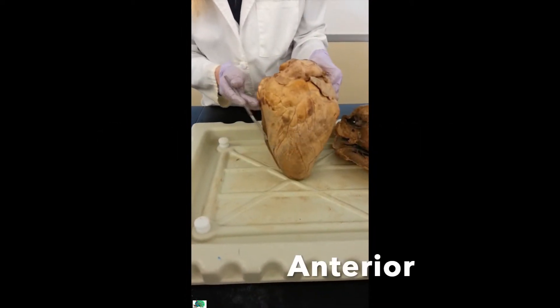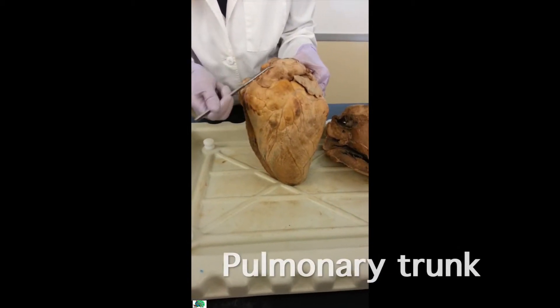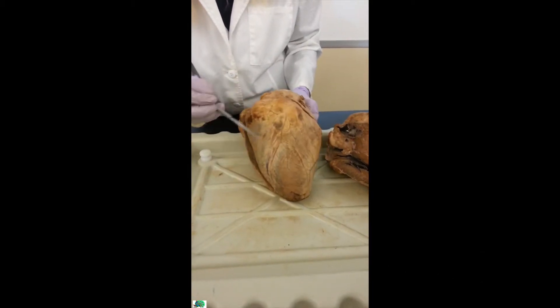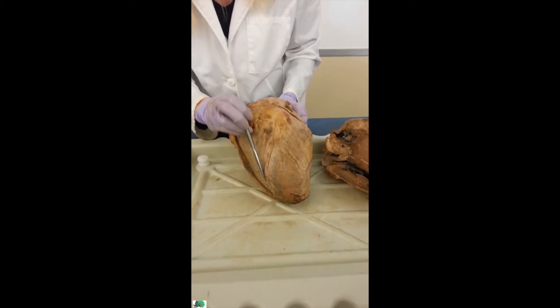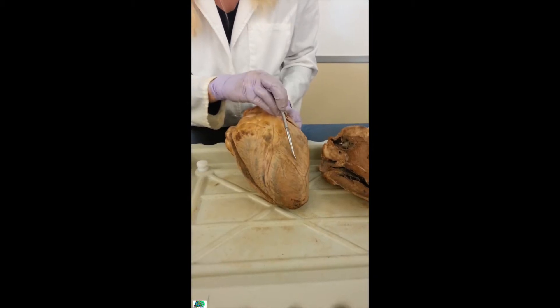This is the anterior side of the heart, because it's a clean part. All you see is this nice pulmonary trunk. This nice diagonal line right here is the anterior interventricular sulcus, dividing the right side from the left side.